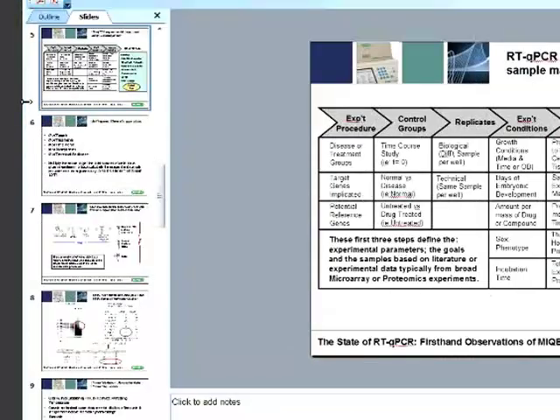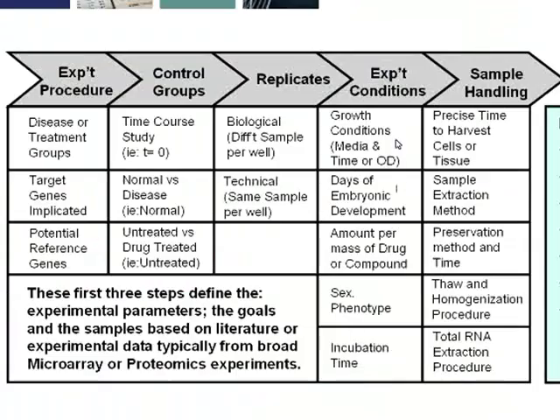So it's very, very important to assure that when you conduct an experiment that you try to control all of these factors so that the final outcome of the experiment is the result of the biology that you've introduced, your own treatments that you're introducing between your sample groups, and not because of a temperature difference between incubations or potentially a drug that was much more potent from one lot from a company than from a different lot.